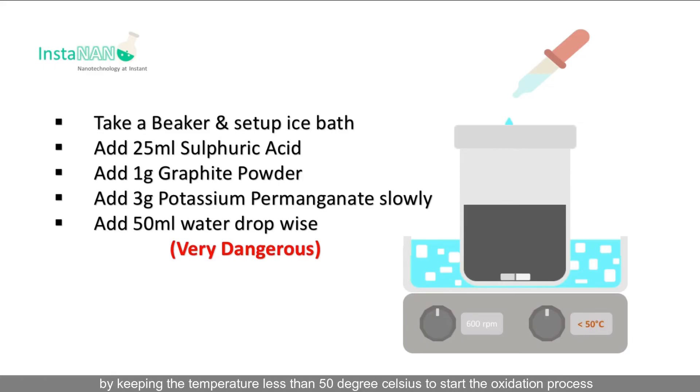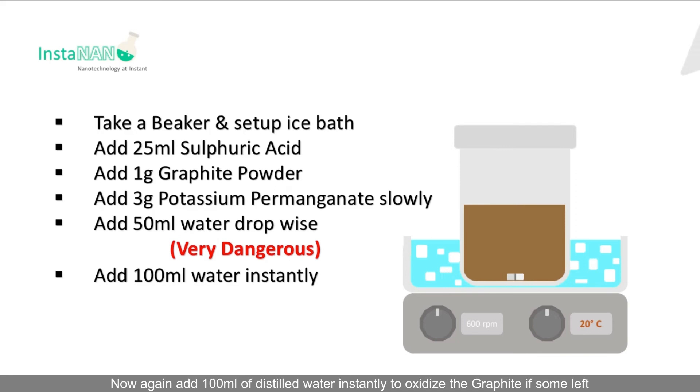Now the most dangerous step: add 50 ml of distilled water dropwise, very slowly, keeping the temperature less than 50 degrees Celsius to start the oxidation process. After some time the color will change to dark brown, indicating the formation of graphene oxide.